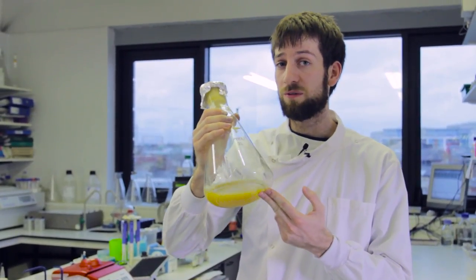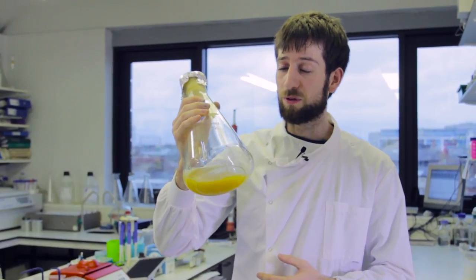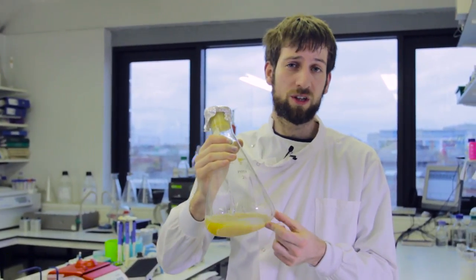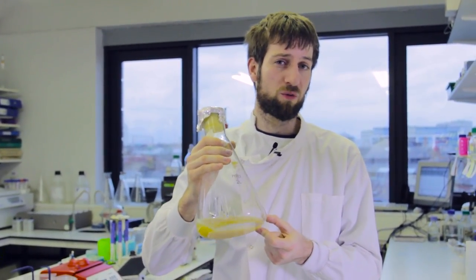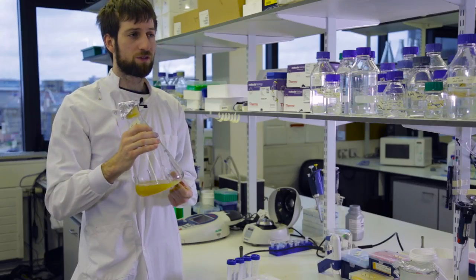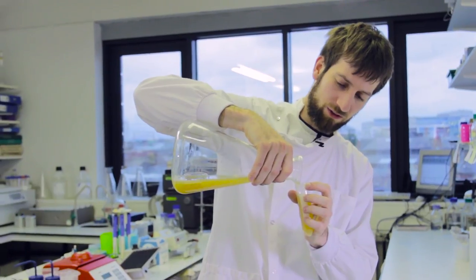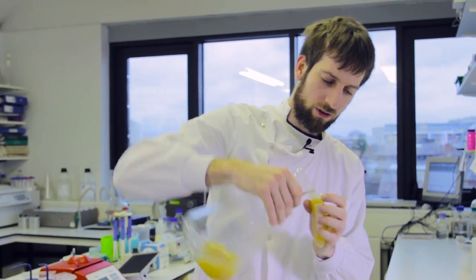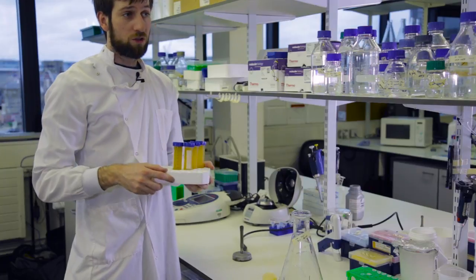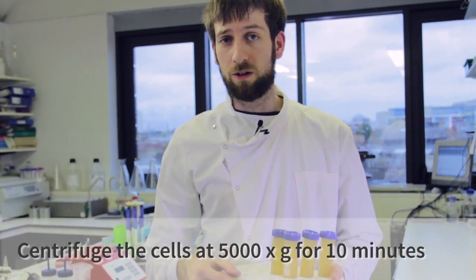Now you can see our cells have grown to an even higher density and hopefully produced lots of our protein. We need to separate the cells from the spent media in order to purify our protein. We do this by using centrifugation. So we'll just carefully pour the cells into the tubes and repeat until we run out of cells. Now we'll take the tubes to the centrifuge and spin them to pellet the cells.